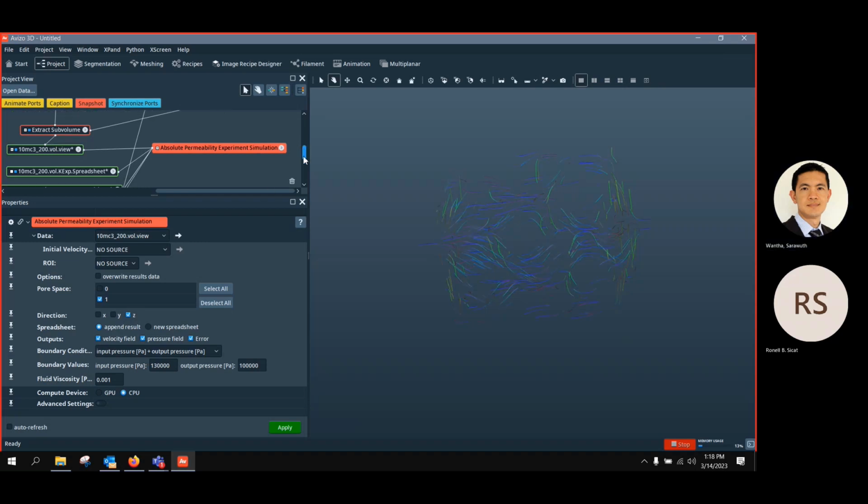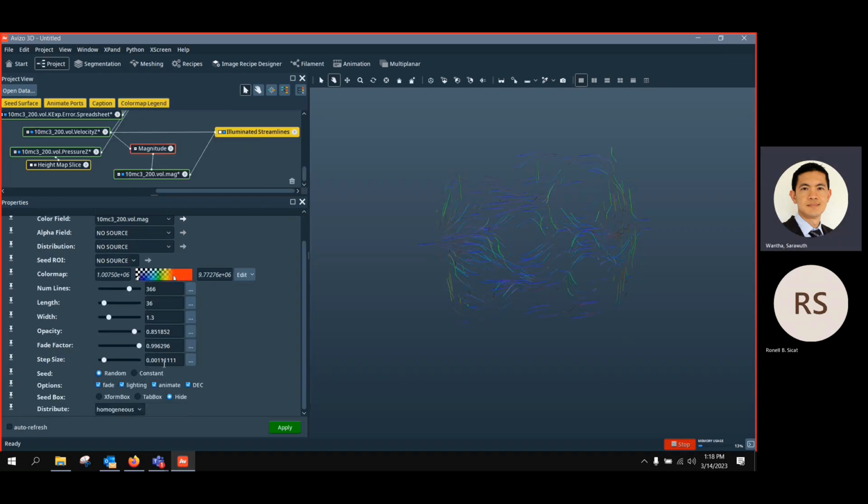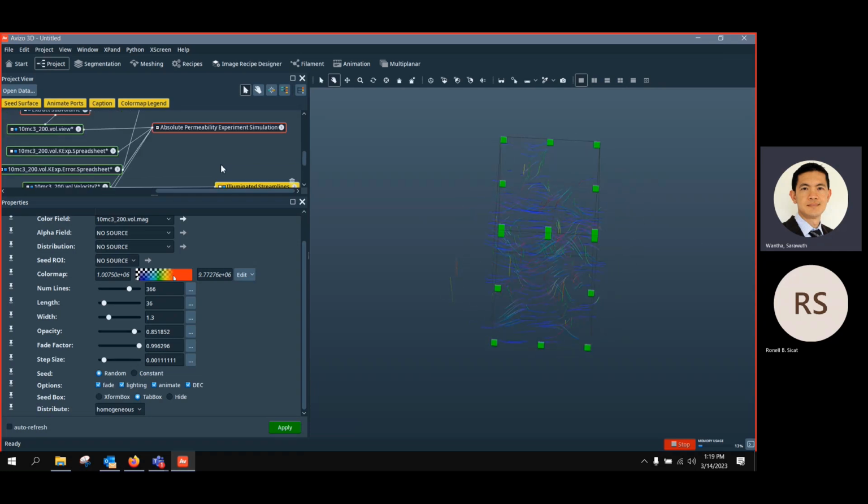Yeah, I understand, but I'm not sure because you can see here we have the tab box. You can select the tab, but if I crop them, that's the first question I got. And then click apply. Yeah, seems okay, possible. You just define the tab box where you want to visualize them.